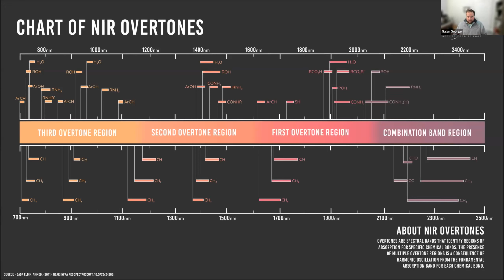And really, in practice, I think this is what is used most commonly. Because of its simplicity, because it doesn't require a whole bunch of data scientists in a room to do all this kind of wavelength selection, and it doesn't require rigorous studying, it just seems like the most practical way to go about things. And it overall doesn't really affect performance in a very negative way that you might think it would, because all these wavelength selection methods exist. You might think, oh, it's really important to do that, but it's been shown many times that it's not as significant to the overall performance of the model as you might think.